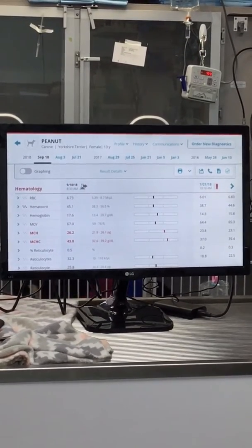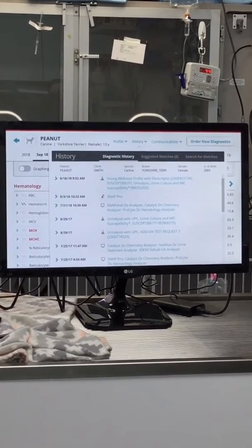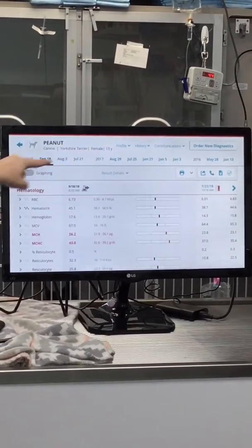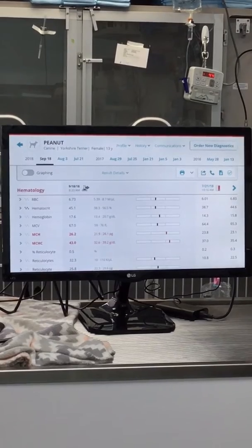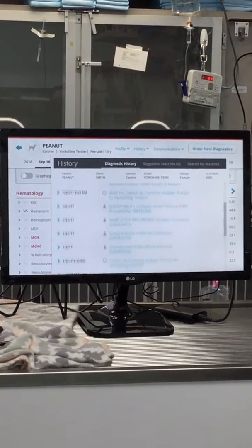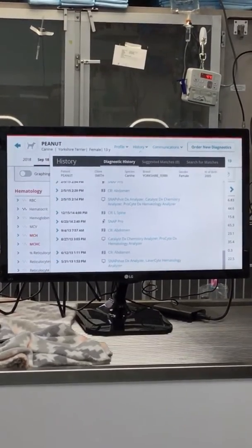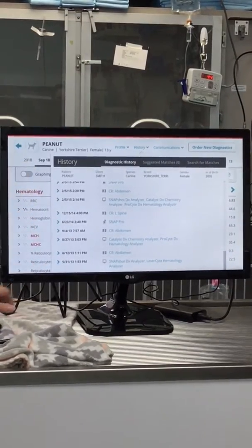So what you typically have is you'll have your CBC on top. Oh, sorry. All right, so we've got our dates right here, right? So this is everything that's ever happened with that patient. If you want to see what happened on the respective dates, you can do the drop down, and it's all of the history of what she's ever had done to her. So instead of having to go through each date, you can see all of the different testing that's happened. Again, regardless of what it is, you can see x-rays, you can see snaps, you can see in-house, you can see at the reference lab.